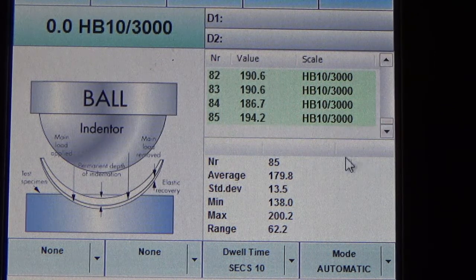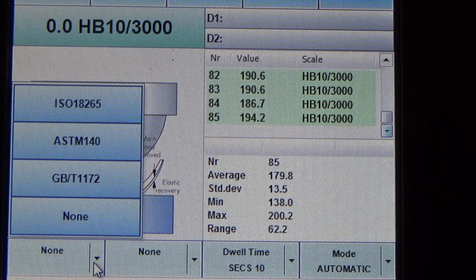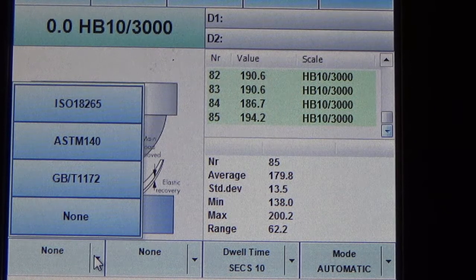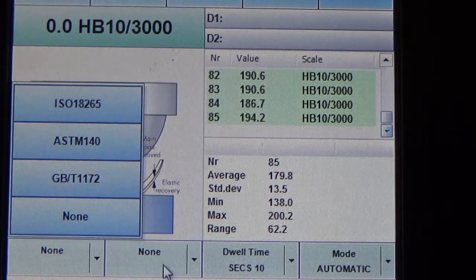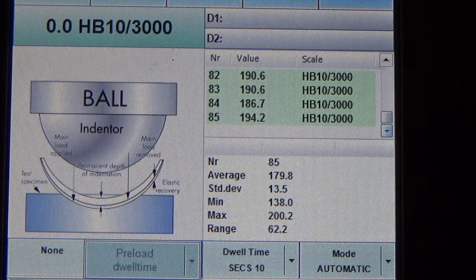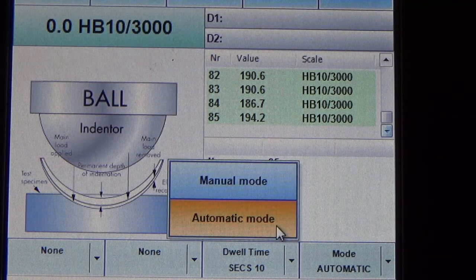At the bottom part, the first and second columns are conversion settings whereby you can choose different hardness scales based on your requirement — for example, you can convert from Brinell to Vickers or to Rockwell A, B, or C scale. Next will be the dwell time whereby you can change from 10 seconds to other durations as needed, and the last setting will be the mode, whereby normally we will just set it to automatic mode.